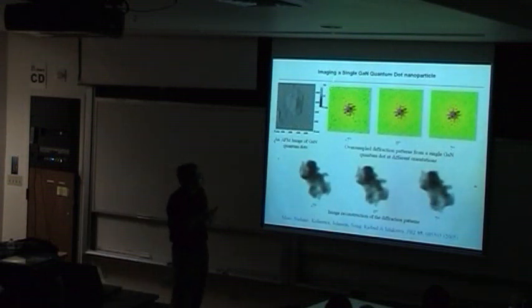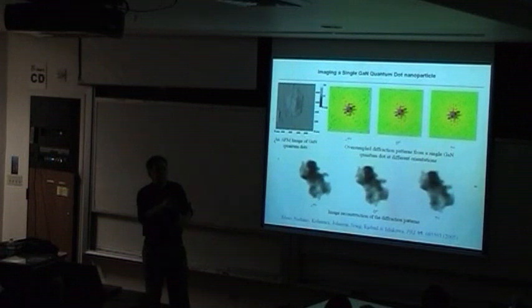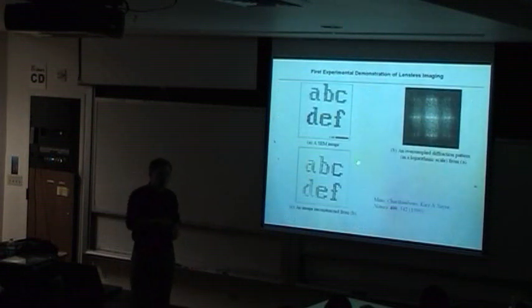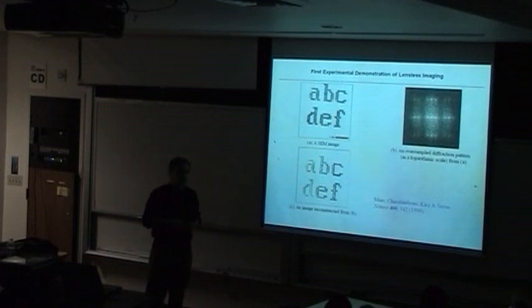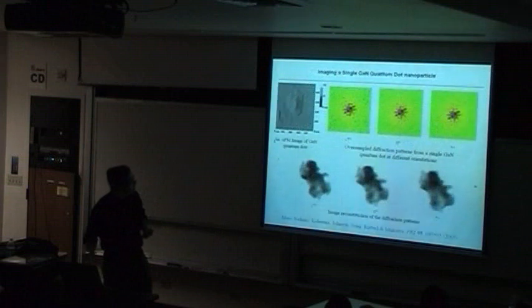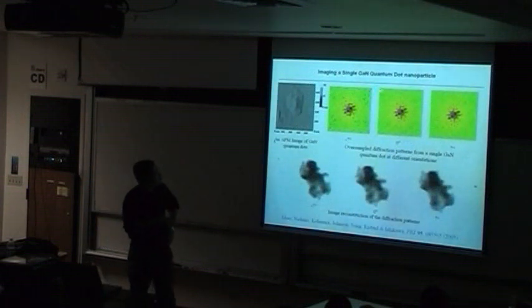So here I want to show the 3D reconstruction. I want to show some applications. Yes. What was the wavelength in that picture? So the wavelength is 17 angstrom. It's 1.7 nanometer soft X-rays. And here it shows gallium nitride quantum dots nanoparticle.